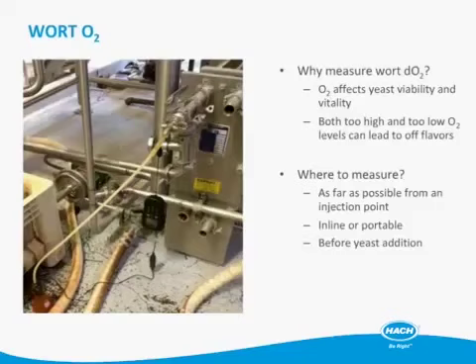The bottom line is that the yeast is using fermentable sugar from the malt. They're also consuming some of the amino acids that are in the wort. It seems like this amino acid consumption really requires optimal oxygenation. If it's too high or too low, the yeast consume the amino acids in the wrong sequence, and by doing that can create a lot of unwanted off flavors and a lot of unwanted problems.